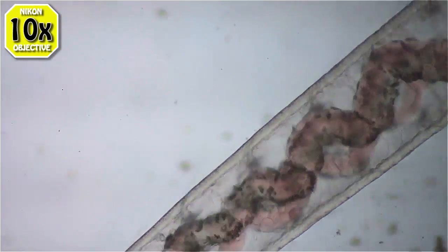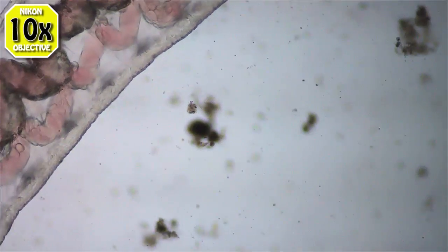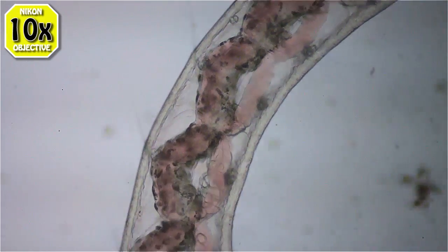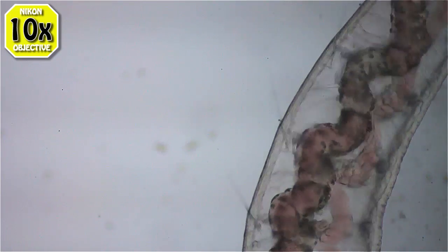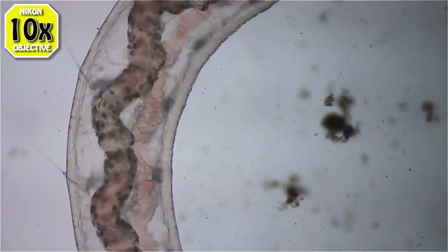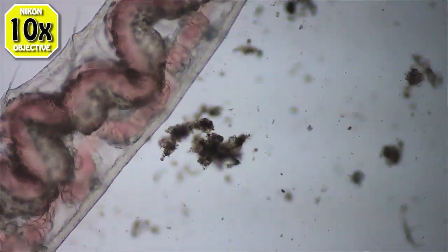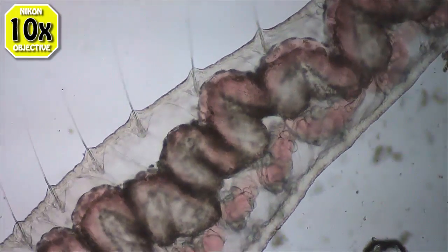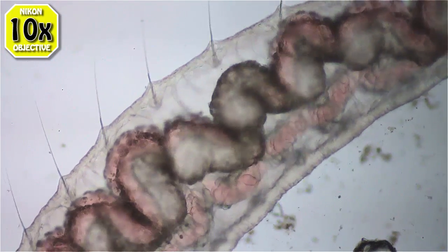There's his bristles. Inside, the pink thing is I guess his main artery. The brownish thing is his gut, intestine.